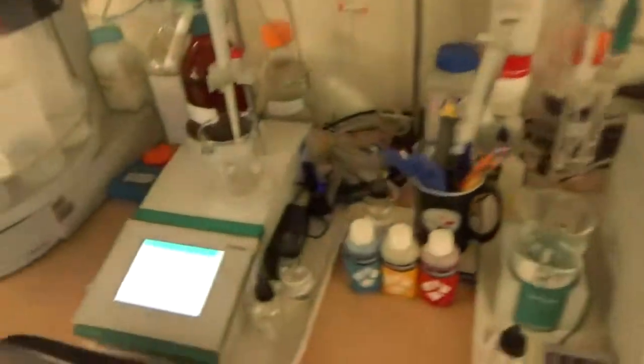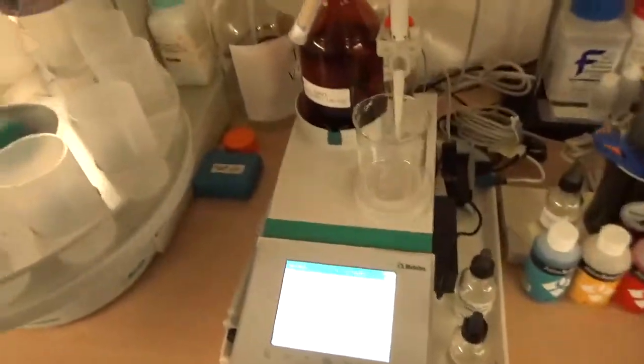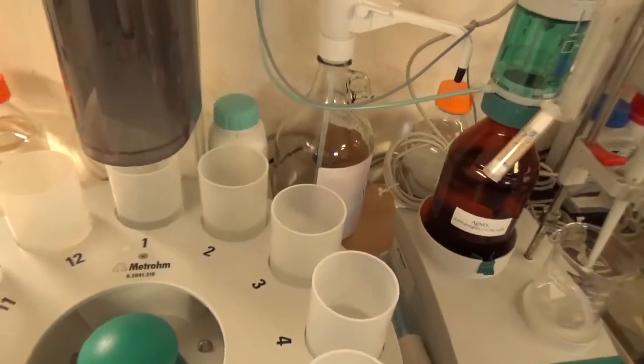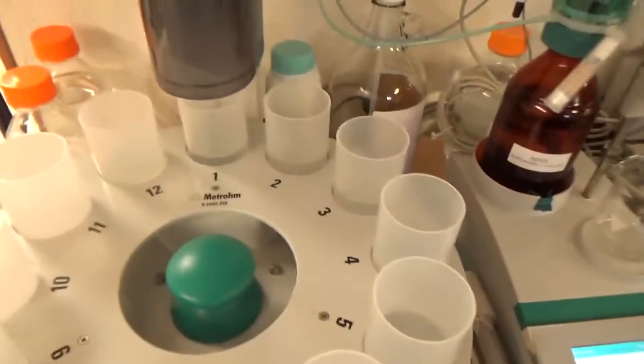To do the potentiometric titration, we collect the samples and put the acid-soluble or water-soluble concrete filtrate in Metrohm beakers. We insert a sample table and add the data — sample weight, method, project number, sample ID, date, and where the sample was extracted.